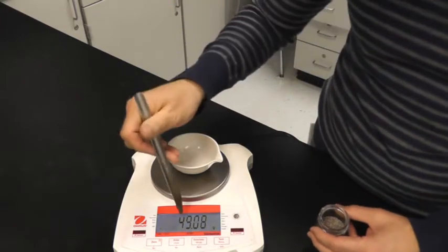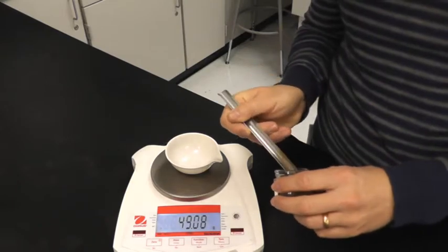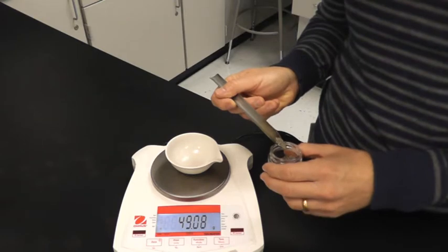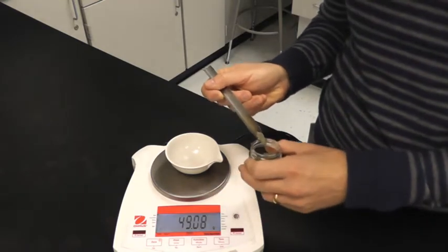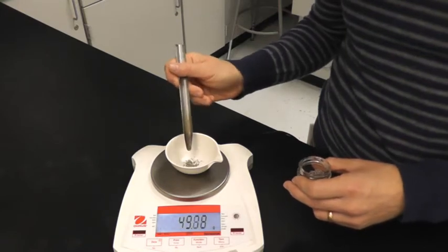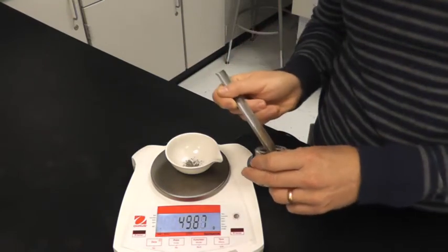So I'm going to set it on here. It weighs about 49 grams. And I just want to add enough to have about 2 more grams. So whenever you look at your lab data, you're going to have a number, which is the mass to begin with. And then I'm going to add it so it's close to 51.